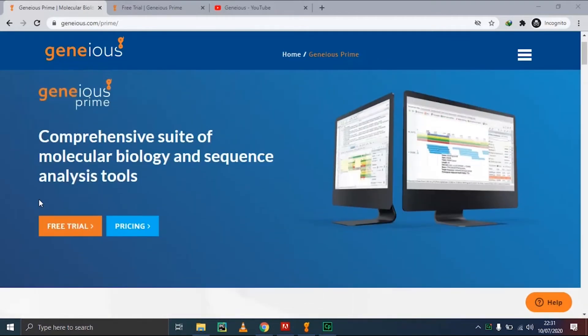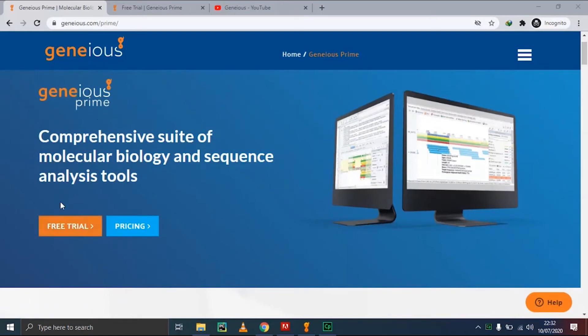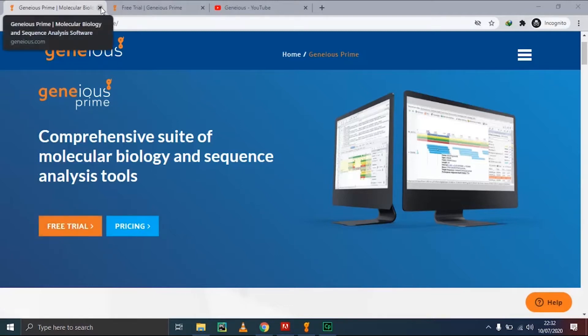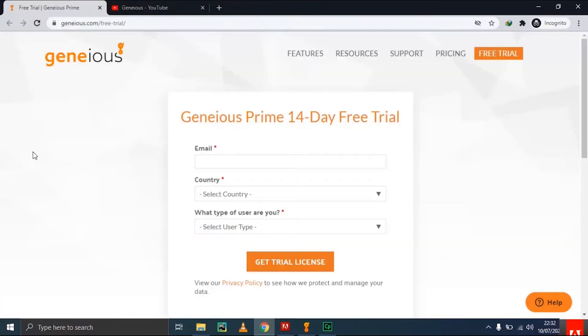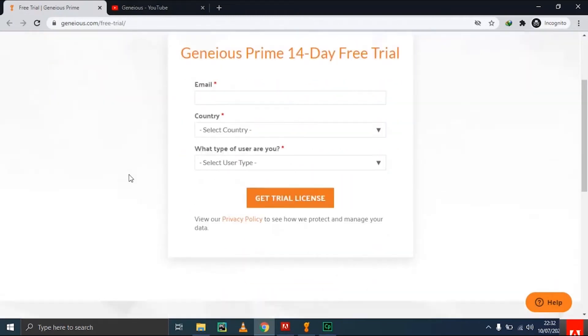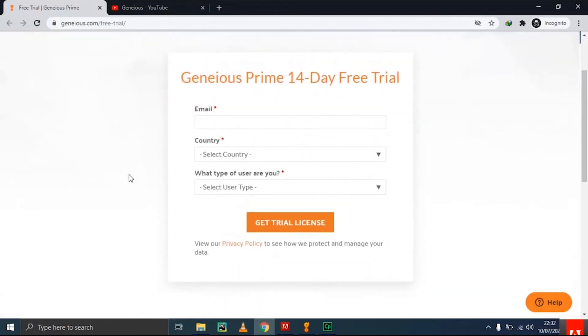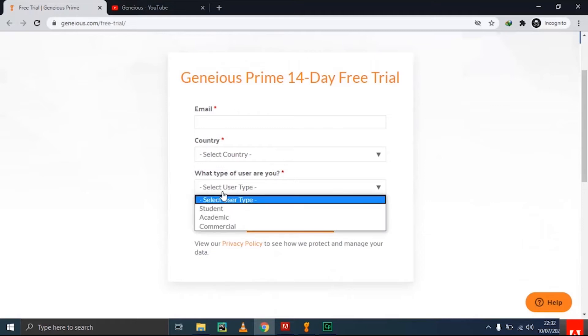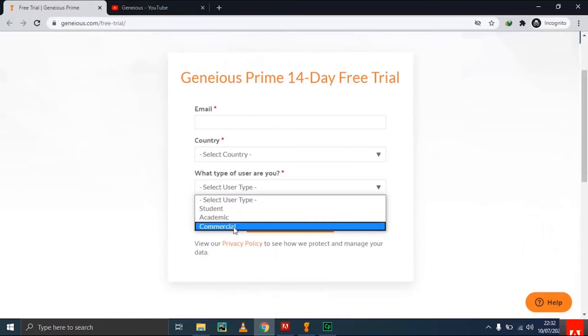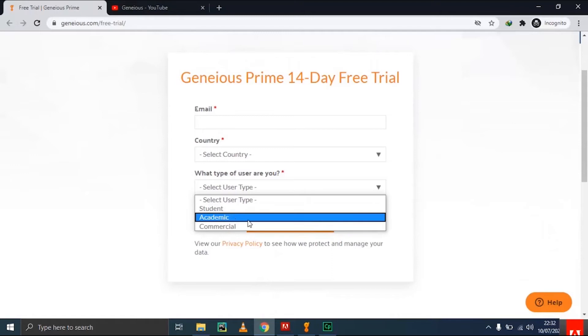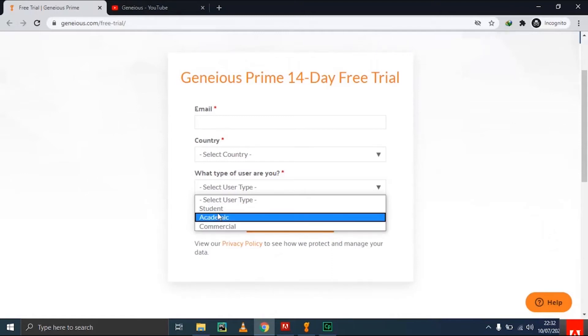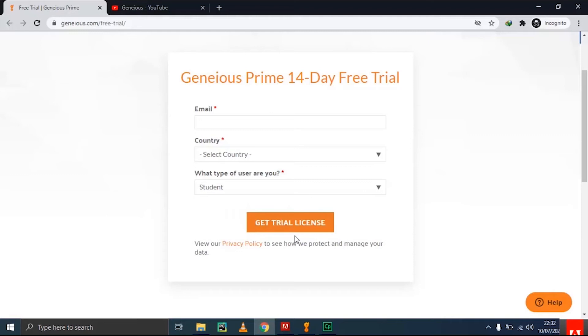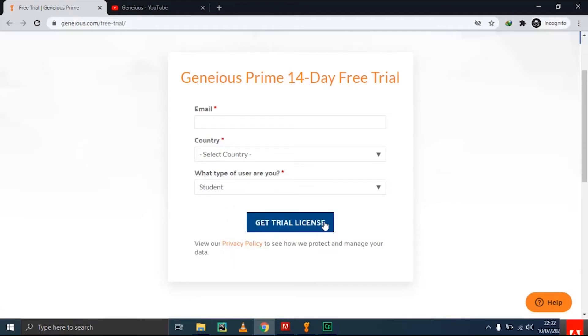It's available as a free trial for 14 days. As a beginner, I recommend you install the free trial to access the full features and get started. After clicking on the free trial button, you can download Geneious Prime by providing your email address, selecting your country, and selecting what type of user you are. There are three user types: student, academic, or commercial. By clicking get trial license, you agree to the privacy policy and will receive the license key via email from Geneious Prime.